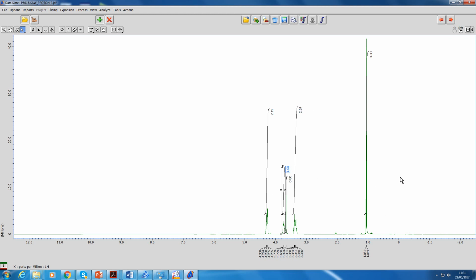So that will do for the time being. What other things can we do? Peak select.